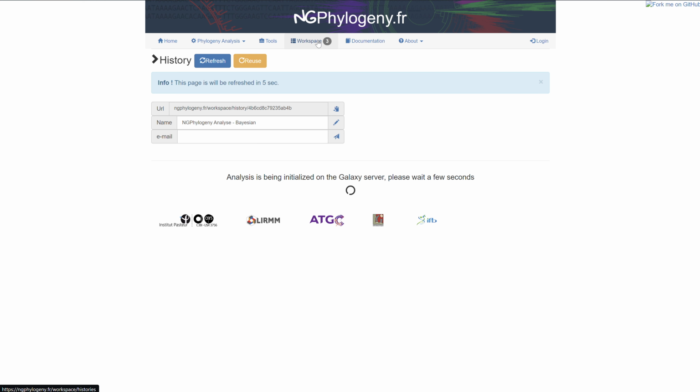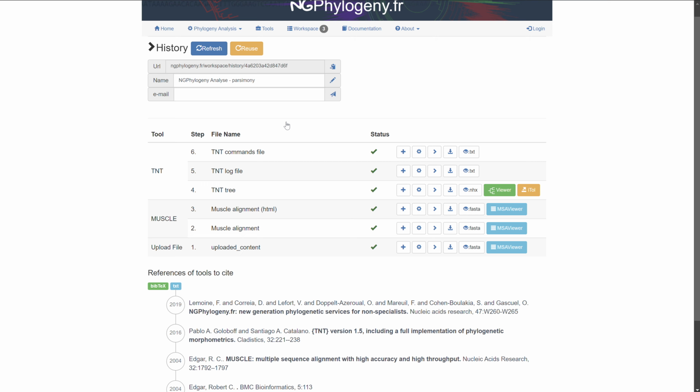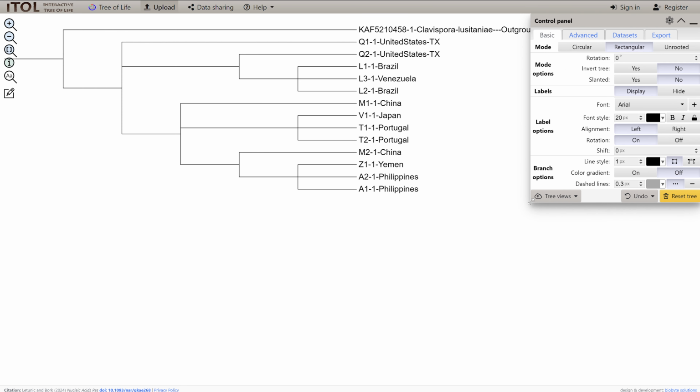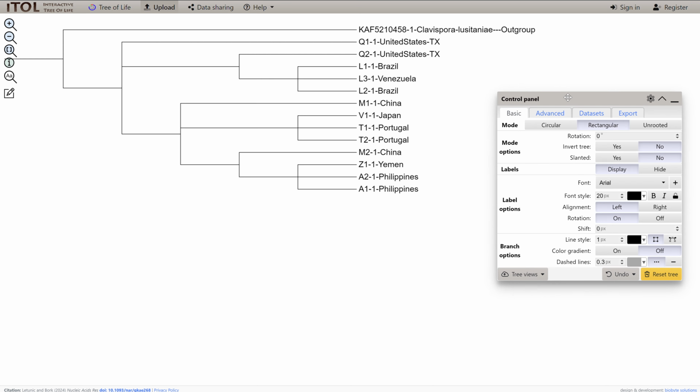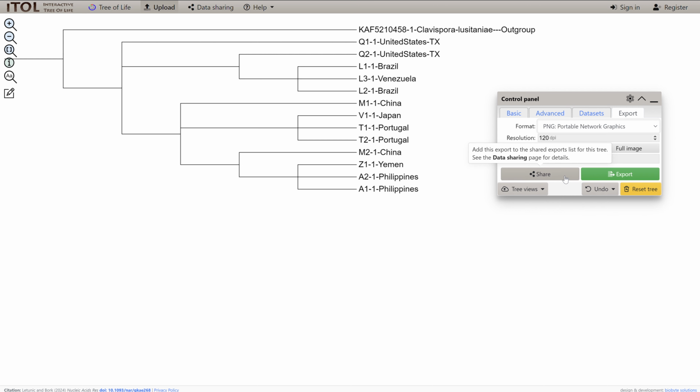Now that this one is in, as the outgroup, which is very nice, we don't have to reroute it. And it's created this tree for us here. Since this is already our outgroup, we're just going to export this so that way you can upload it for your report.